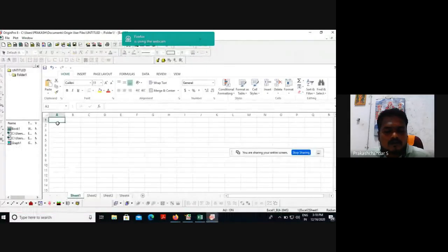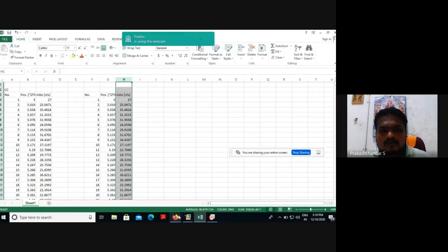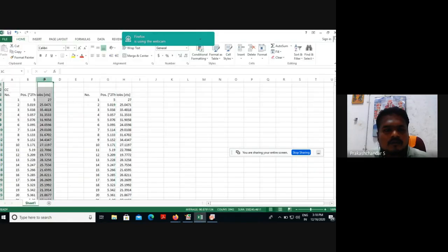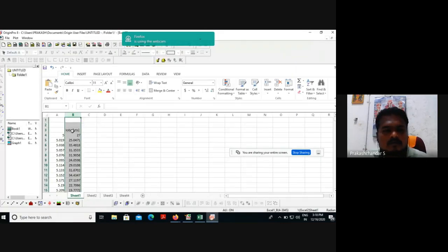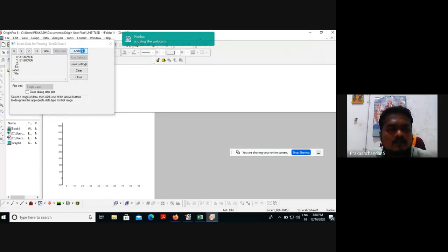So you can make it one more time. Choose the x-axis.